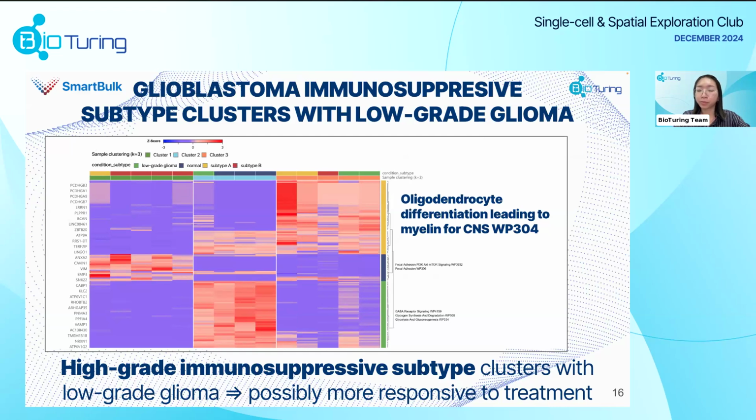if you want to see, for example, I know that my samples have different conditions assigned to it. This is based off of some histopathology diagnosis or some imaging. We know that some of these samples are high-grade tumor versus low-grade tumor, but we also want to further look into the gene expression and whether these are actually high-grade tumors or low-grade tumors, gene expression-wise. And so this is one of the ways that this sample clustering tool can help us.